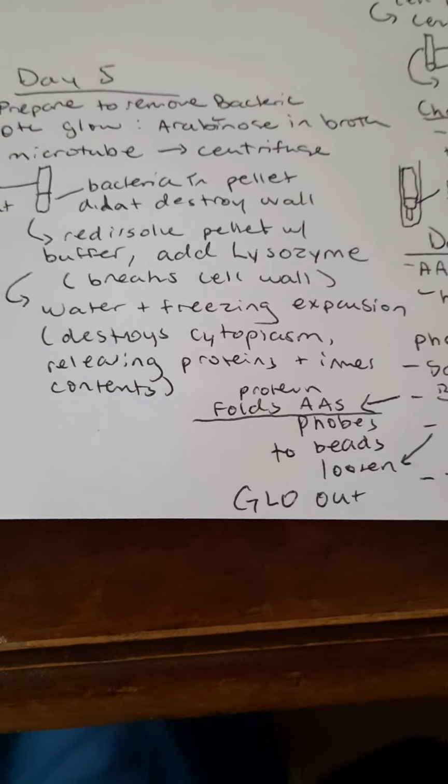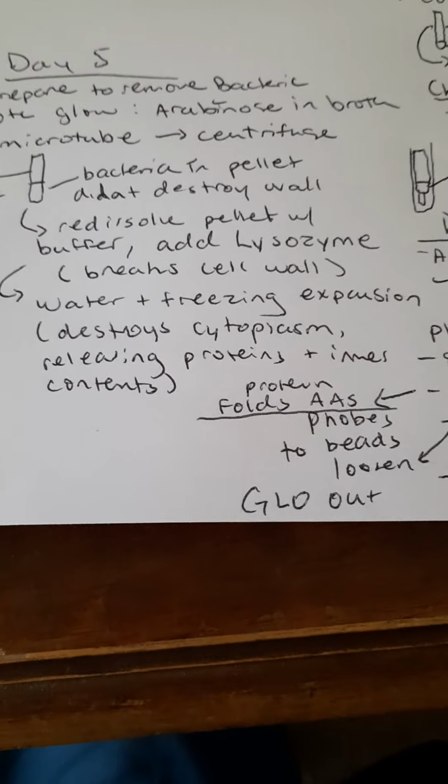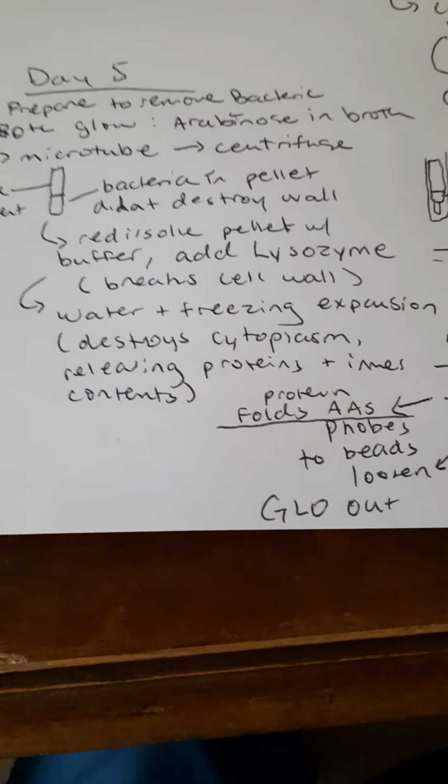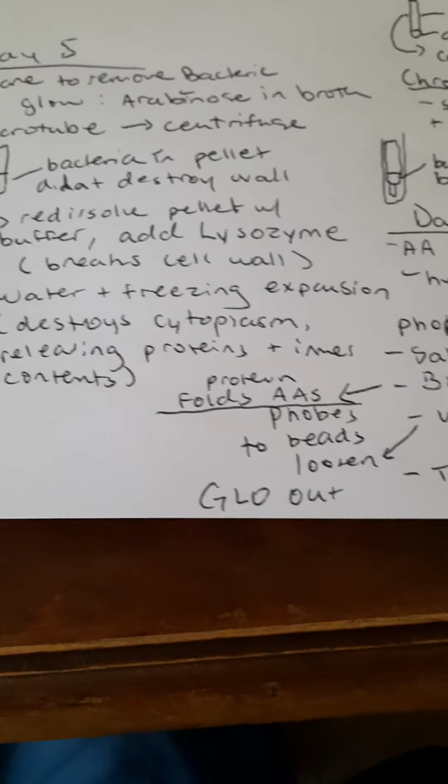And then now we add water, and with the freezing and expansion of the cytoplasm in the cell, again, it'll just release the inner contents and the proteins in the bacteria. Okay, so that's day 5.